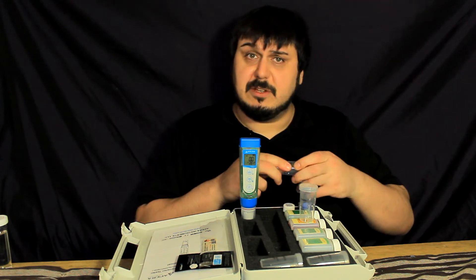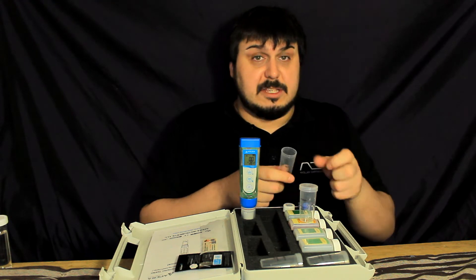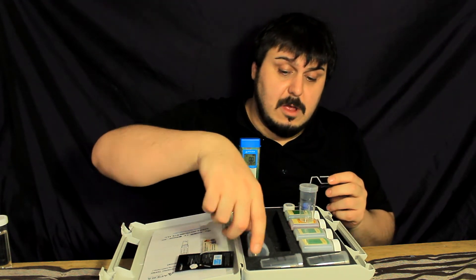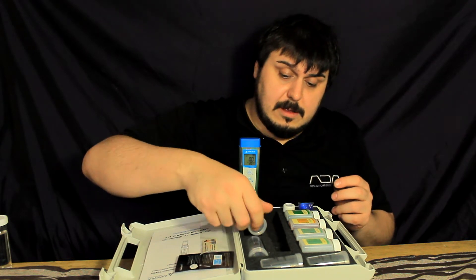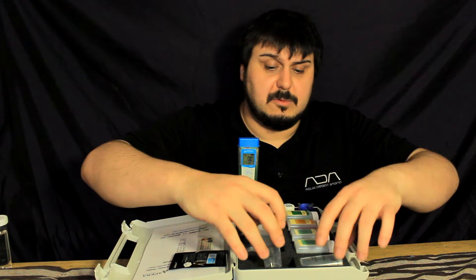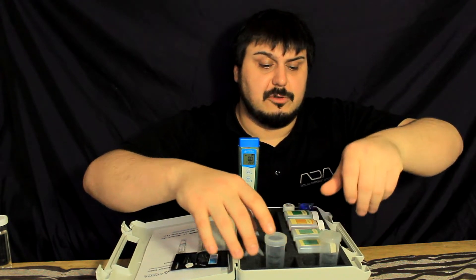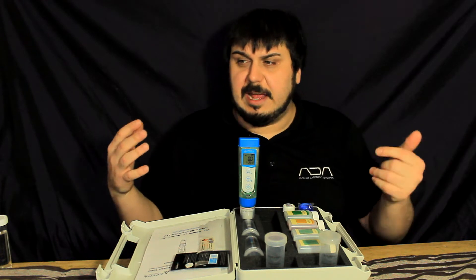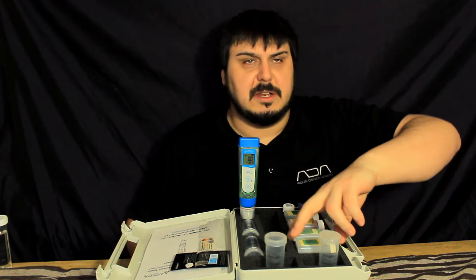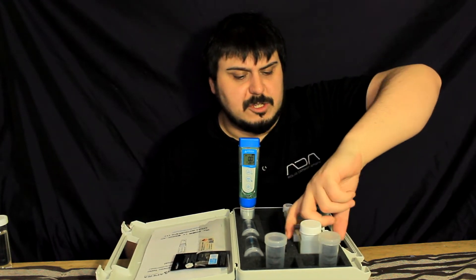These jars can actually be sealed — they have a pretty good seal on them, so if you put the fluid in, it's not going to leak back out when you put it into the case. You can store your fluid in there. It also comes with calibration bottles for EC (electrical conductivity), TDS, and I believe resistivity and salinity as well. So it comes with all the testing solutions.